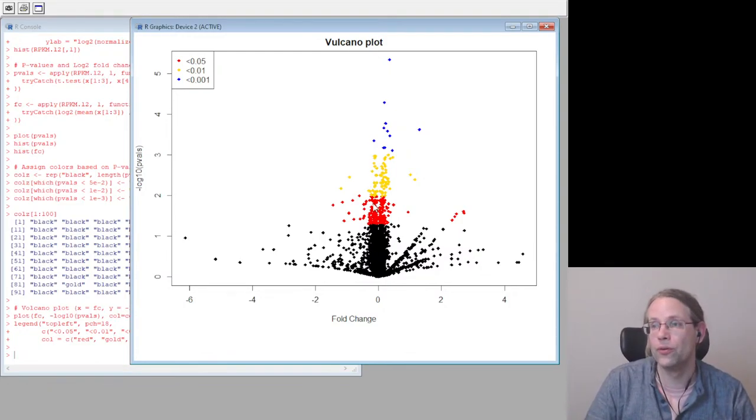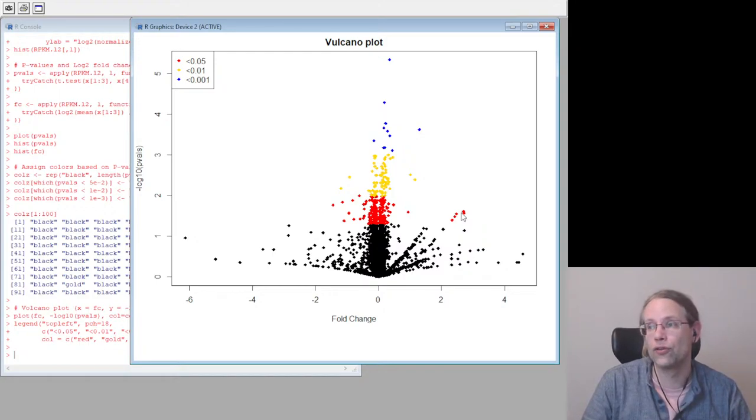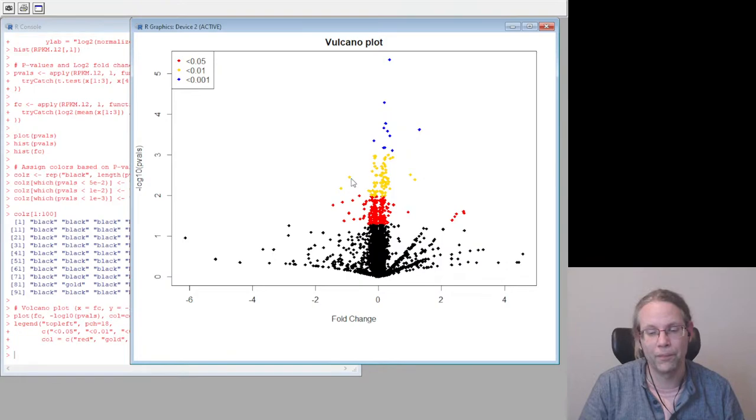So we're now going to continuously, more or less, drill down into these genes which are different, and of course we want to focus on the genes which are very different, right? So these 5-6 genes here, they are the ones which are really interesting because they're significantly different and they're significantly upregulated in the SBRC medium relative to the control medium. The same thing holds for these yellow ones here, which are very hard to see, but these are significantly downregulated in the SBRC medium relative to the control medium.